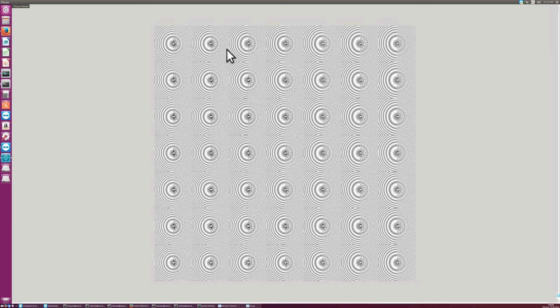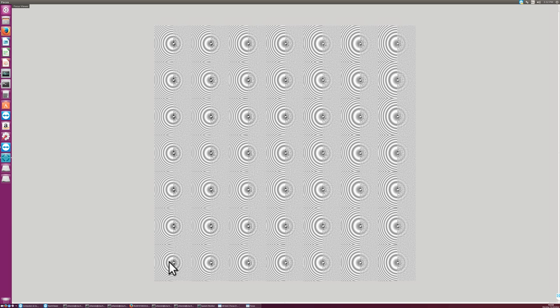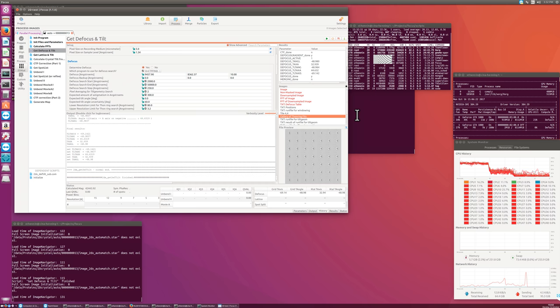And the bottom right one here, to me, looks larger in diameter than this one here, but we will see later. So this is on overlapping 2K images across the image. CTF-Find was run on all of them, and there is a marked version of this file.